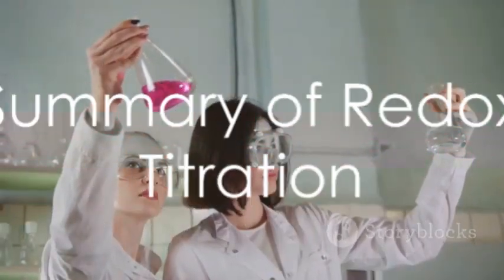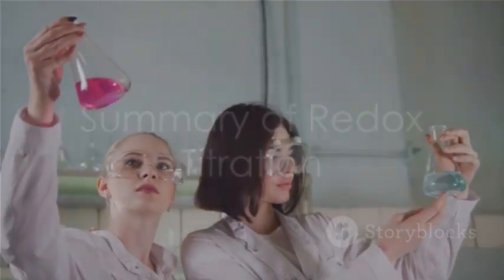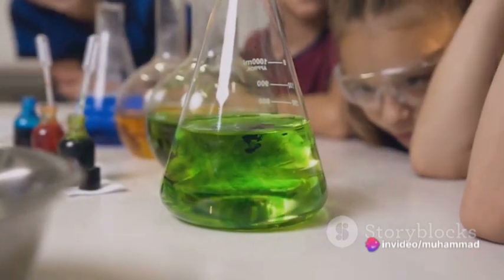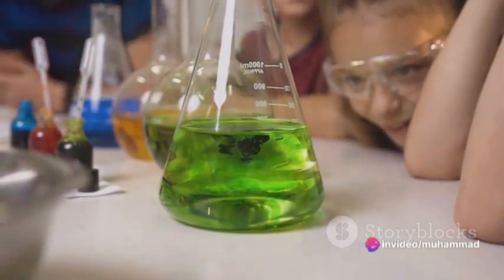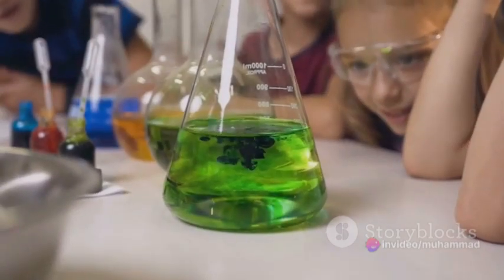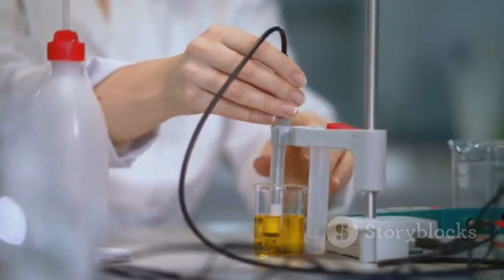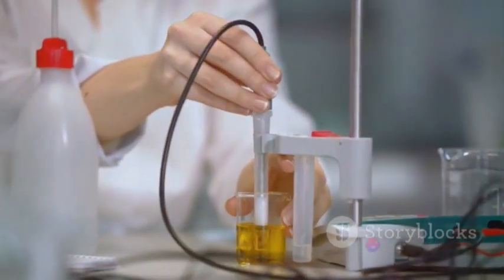In summary, redox titration is a powerful tool in the world of analytical chemistry. It involves a reduction-oxidation reaction, where a known solution is added to an unknown one, until a color change signals the endpoint. The volume of the known solution used is then used to calculate the concentration of the unknown solution.